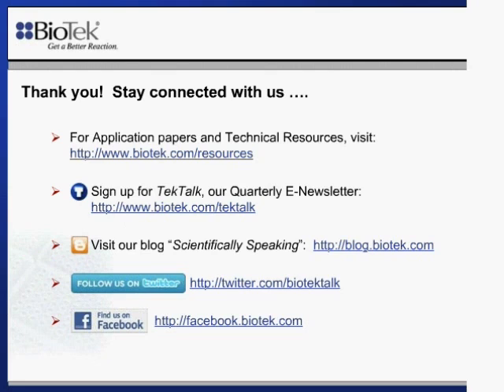I haven't tried it here, so I don't know, but I do know several customers have tried it, and they were having some issues with some of the contaminants in there and some of the buffers that are used. RIPA buffer, I think, is used in some of those, and that does contain a detergent which can interfere with quantification. So again, it comes down to a contaminant issue.